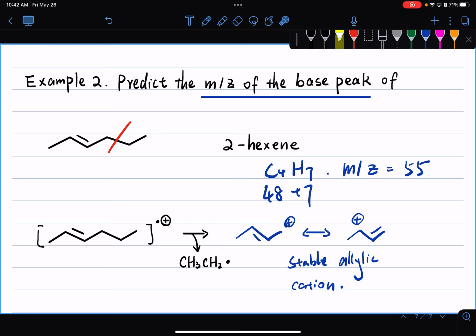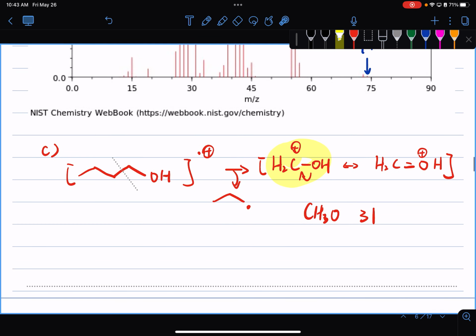If you have a carbon attached to an OH group and two carbons attached to that, is there a specific one that we're supposed to choose for alpha cleavage? Well, both of them will be cleaved. You'll see two different peaks. Alpha cleavage: say this one is a carbon that's directly attached to your alcohol group, then the adjacent carbon-carbon bond is your alpha carbon-carbon bond.